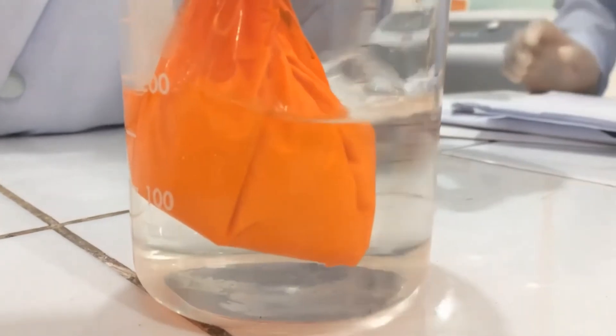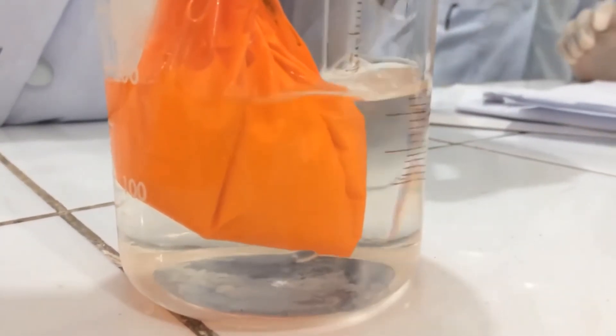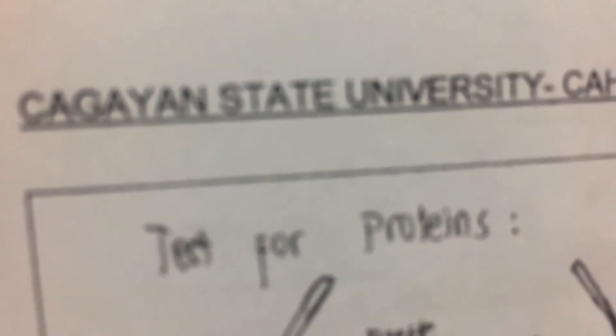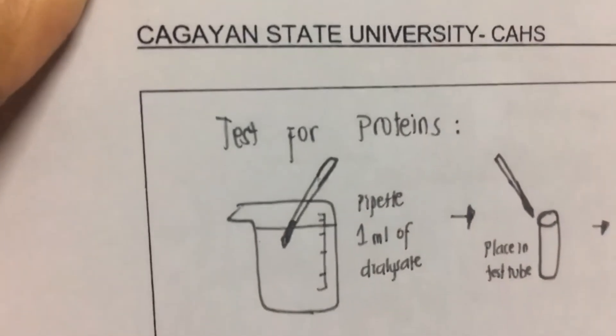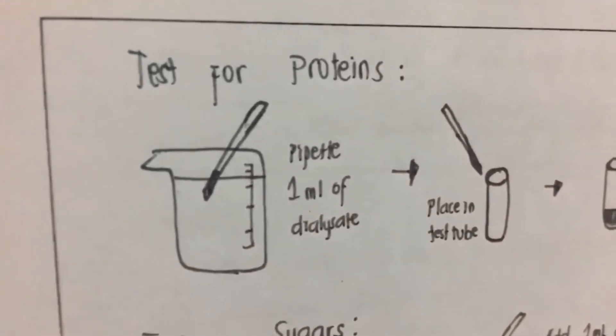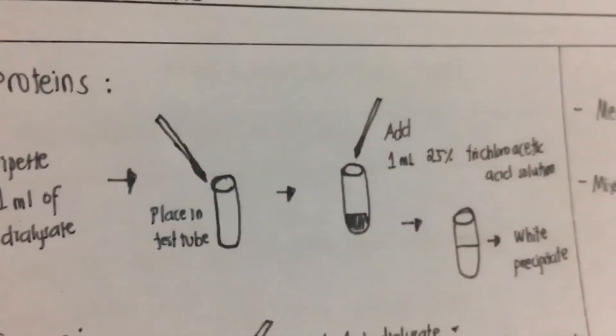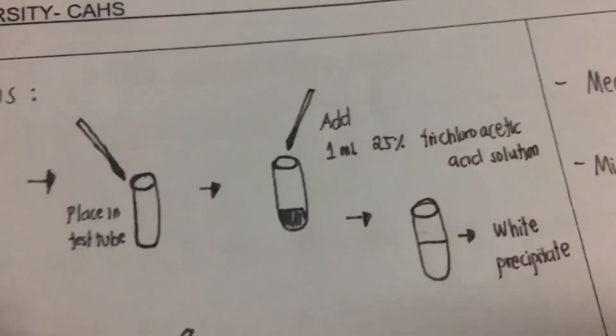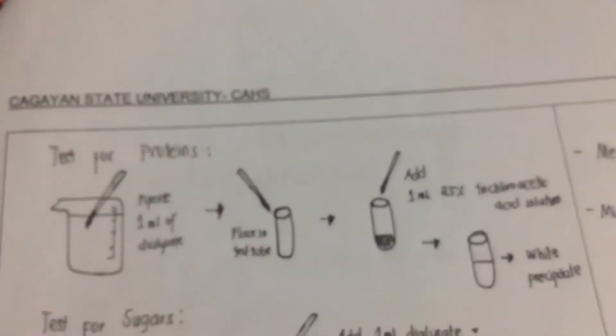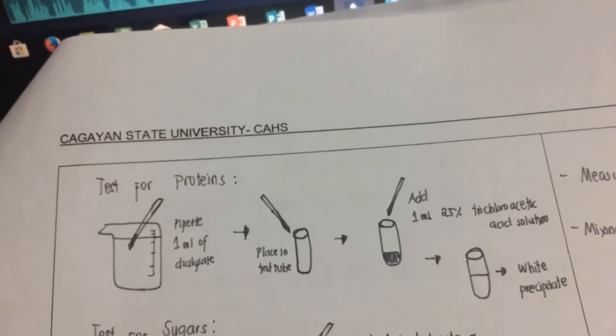After one hour, collect the dialysate. Let us test for the presence of proteins and sugar in the dialysate. For protein testing, pipet 1 ml of the dialysate and place it in a test tube. Then add 1 ml of 25% trichloroacetic acid solution. The presence of white precipitate or turbidity will indicate that proteins are present.